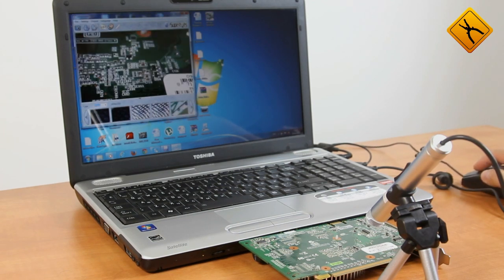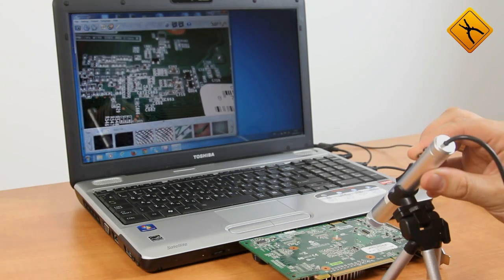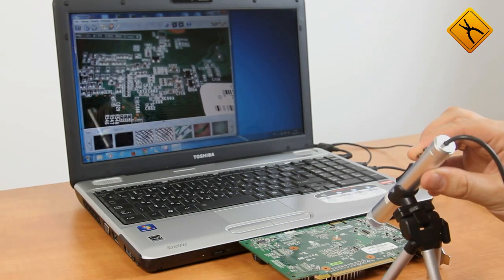We'll take a few pictures. First, a video cardboard. So, press the button.